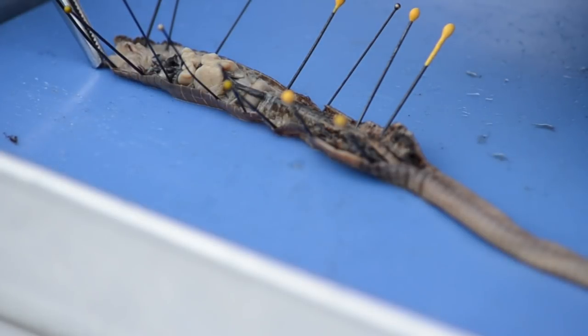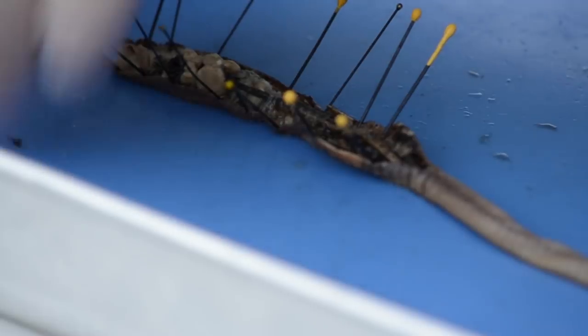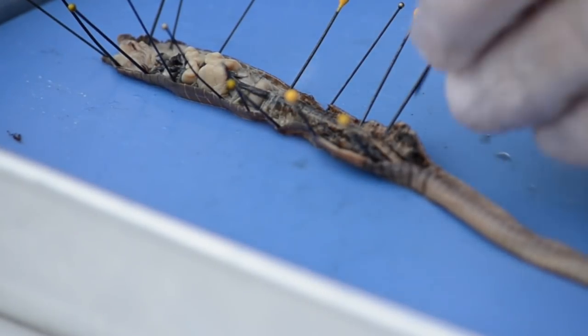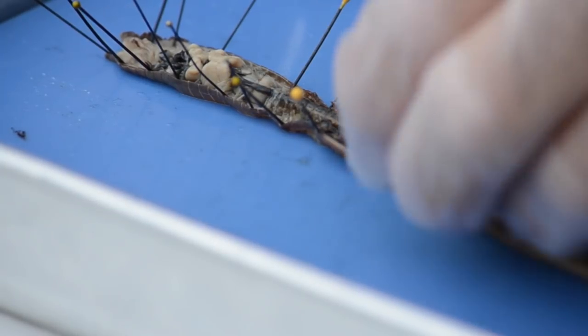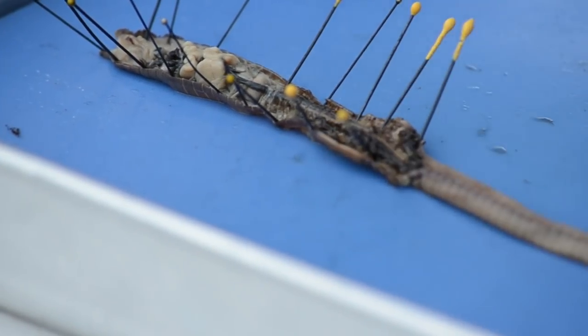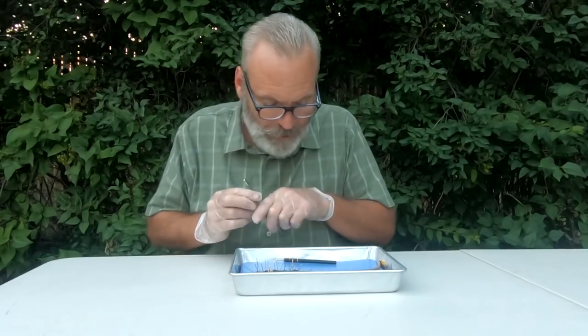We've got a cerebral ganglia right there — not too bad. Now, as you can tell, I got down a little too deep right here. This is where you need to be really careful as you're going through it.